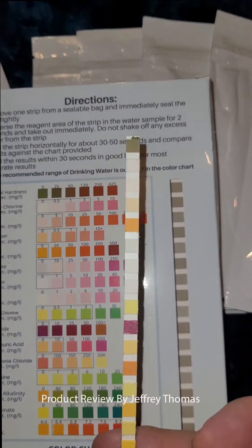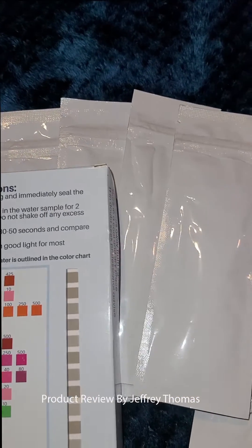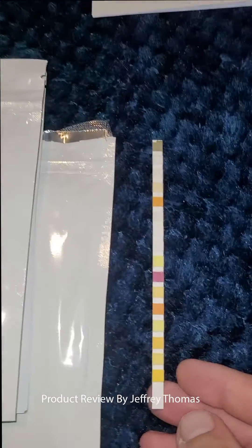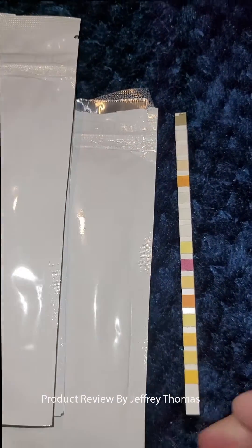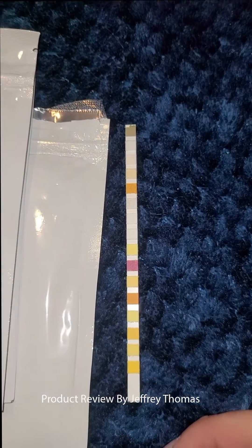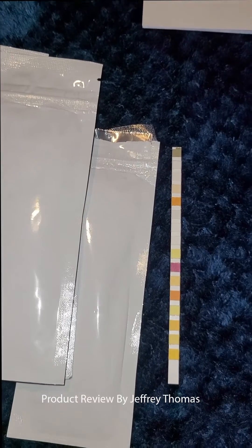It's a great deal for a hundred strips, and I like that they're all packaged in smaller quantities so you don't have to worry about them getting damaged. The strips themselves are nice and long — I've had testing strips that are half this size — so this is a really great testing strip set that you can get for a really great price.